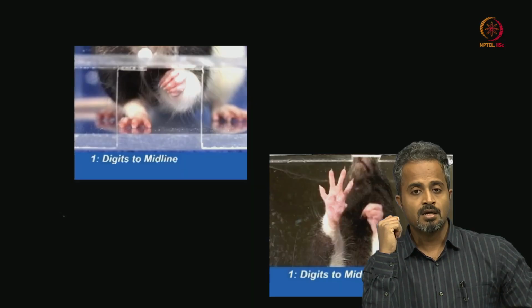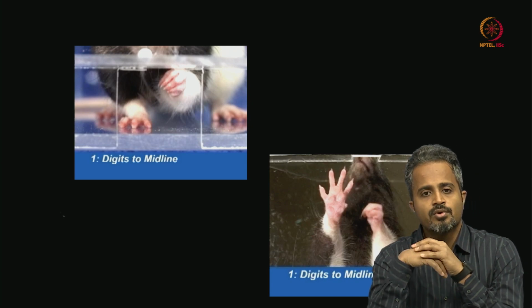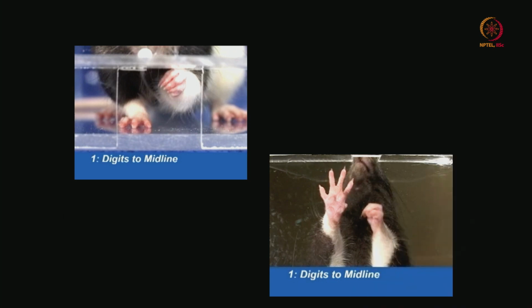All right. So now let us look at these 10 different steps, how they would appear and why it is so important. In these two pictures you can clearly make out that this is the front camera and this is the camera from below. All right.